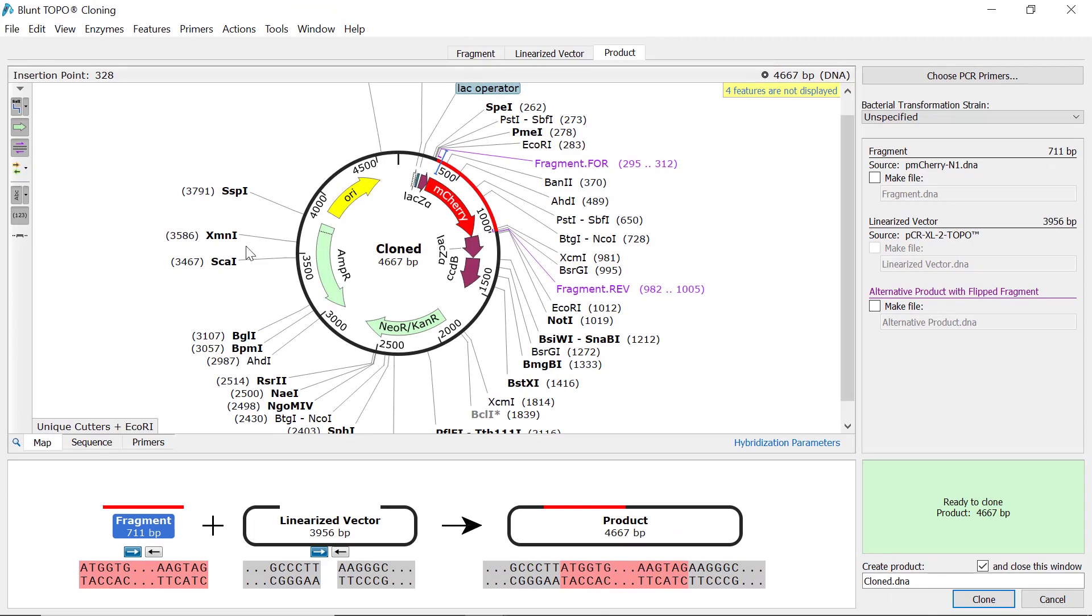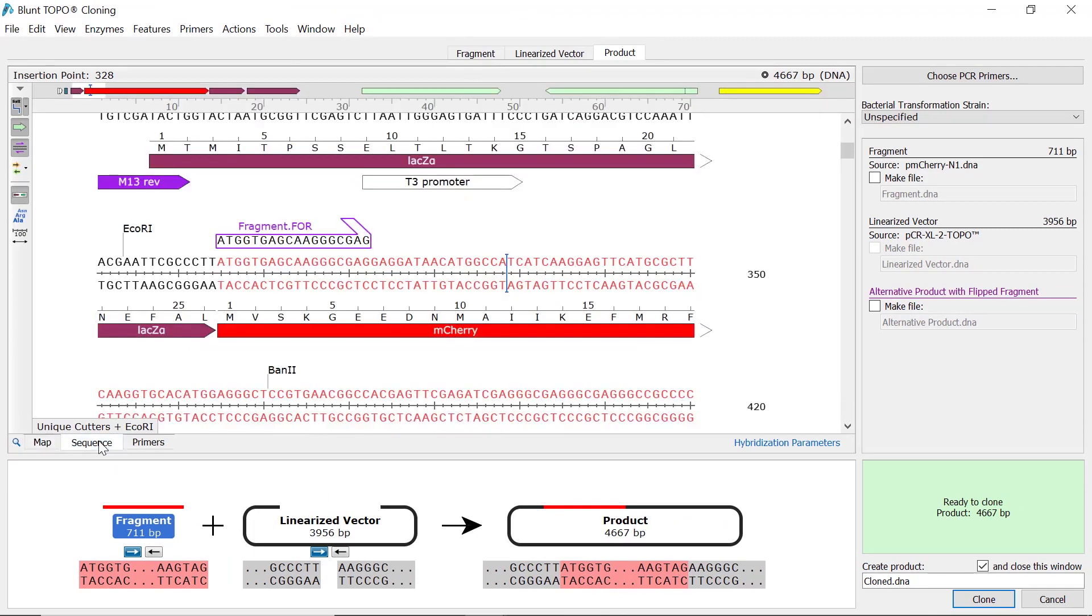Moving on, you can switch to the sequence tab to view and confirm the fragment is in the correct orientation. To adjust the orientation of the fragment, use the arrows at the bottom.